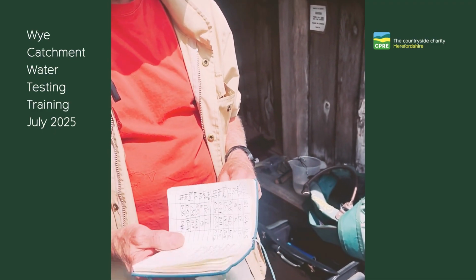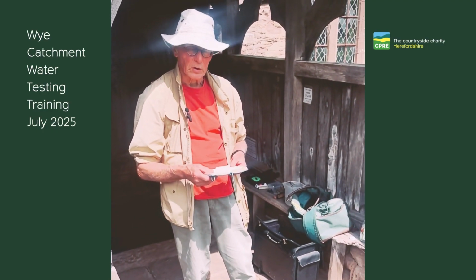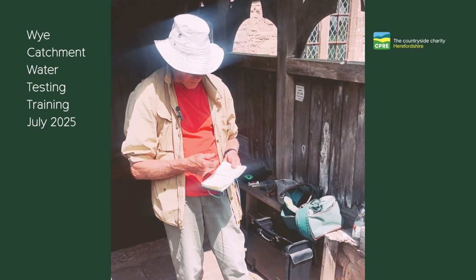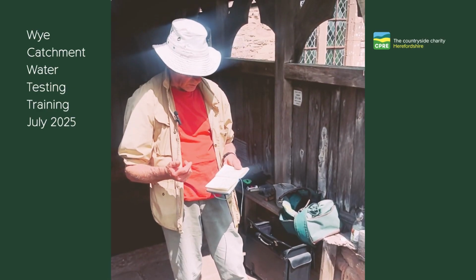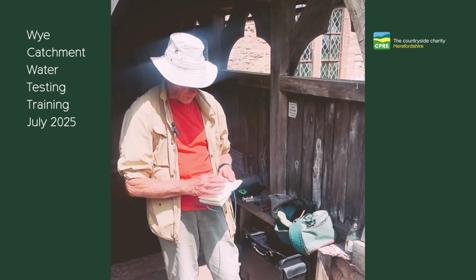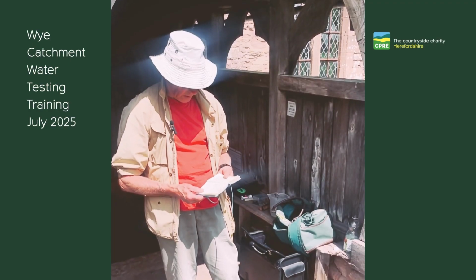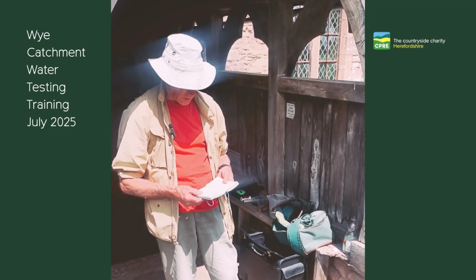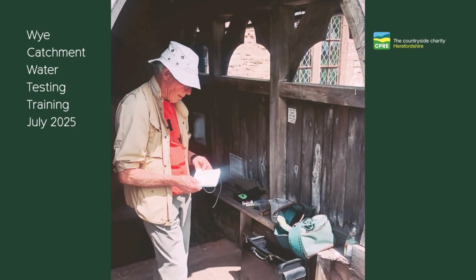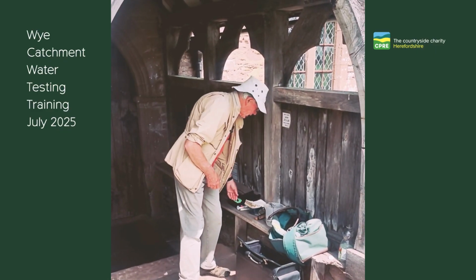It's important to record manually, but you will be loading your data onto an app called Epicollect 5, which I'll come on to later. The reason for recording it manually is that it's very tedious to record each reading as you take it. Once you've got them all in a book, you can run through the loading process very quickly and easily. And also, if anything goes wrong with the app or with your phone, then you've got a record of your results.